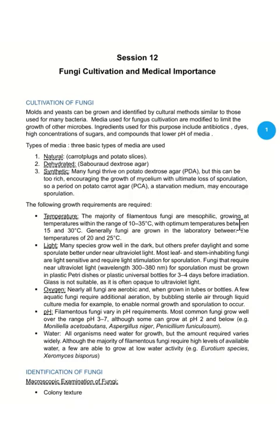Again, it is a synthetic medium, but it is suitable for the fungi, especially the hyphae or filamentous fungi, to grow and produce the spores. So if you want to study the spores of the fungi, you need to culture it on a starvation medium like potato carrot agar.